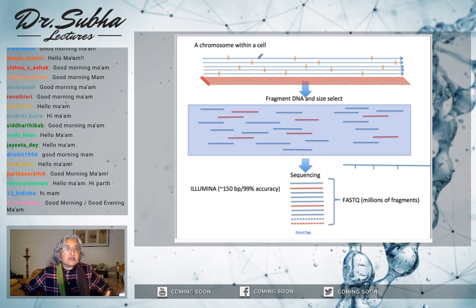Now that they got randomly cut, the DNA fragment from here is more likely to overlap with the DNA fragment from here, right? Because they are not sheared in the same place. Okay, so now you got the fragments. You got all these fragments here, many from the forward strand and many from the reverse strand.